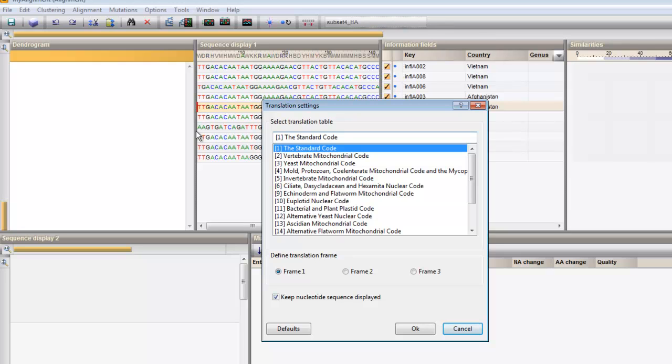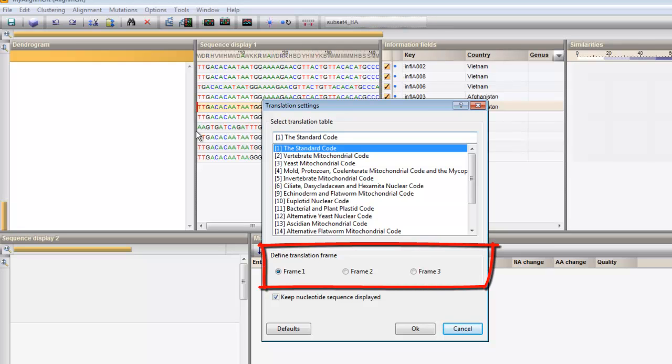A translation table can be selected. By default, the standard code is used. The frame can be set here as well.